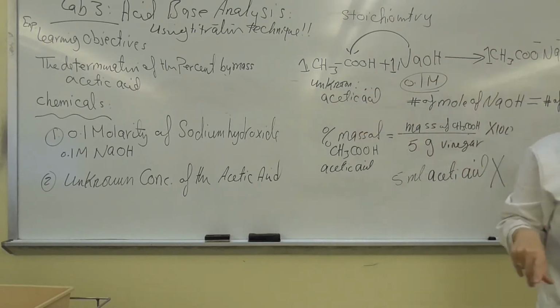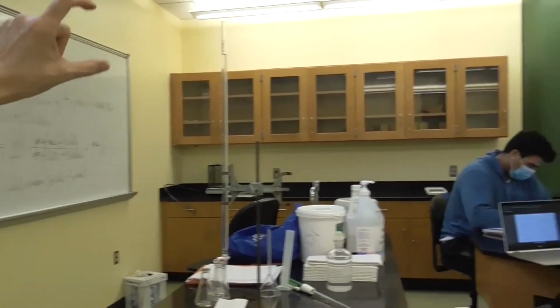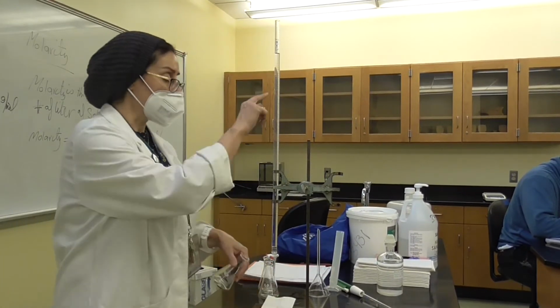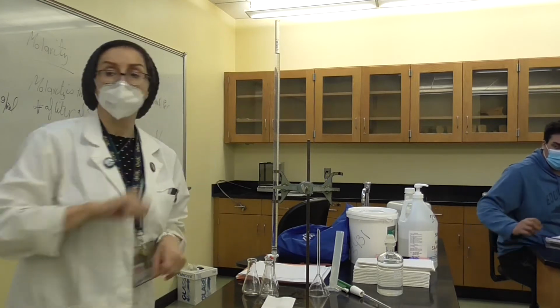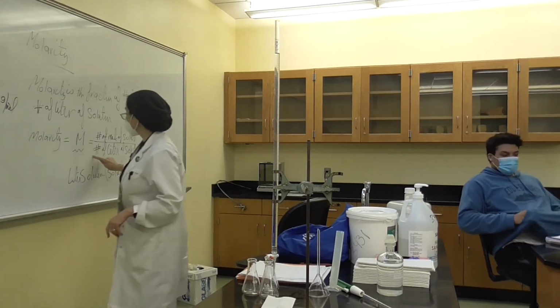After you do the titration, you will be able to find how many ml, because we're going to dispense it, right? So you have to find out how many ml you dispense. And this is going to be the liter. You see here molarity.